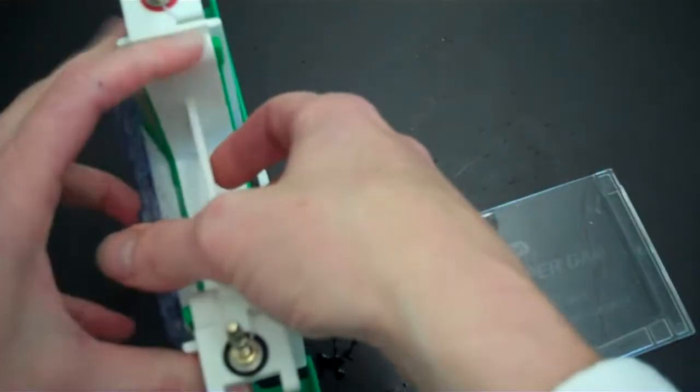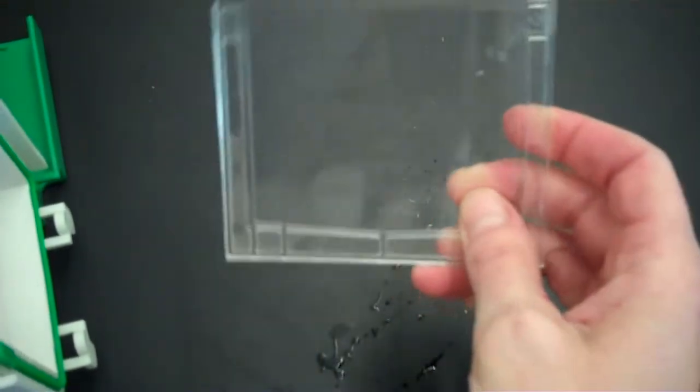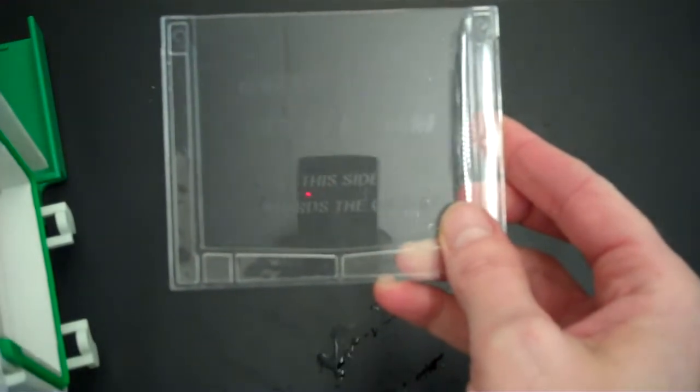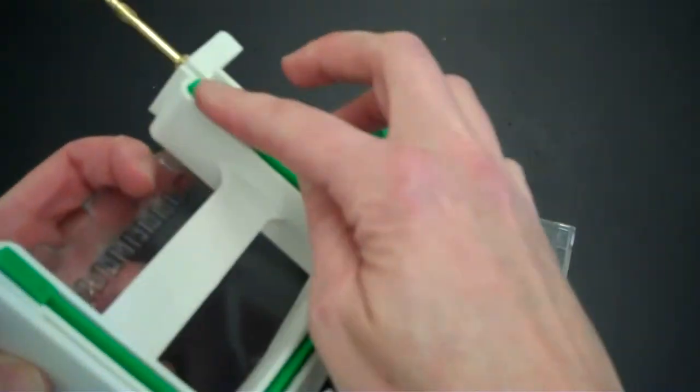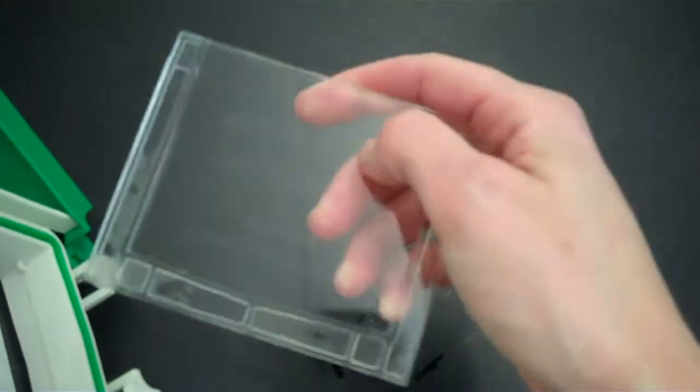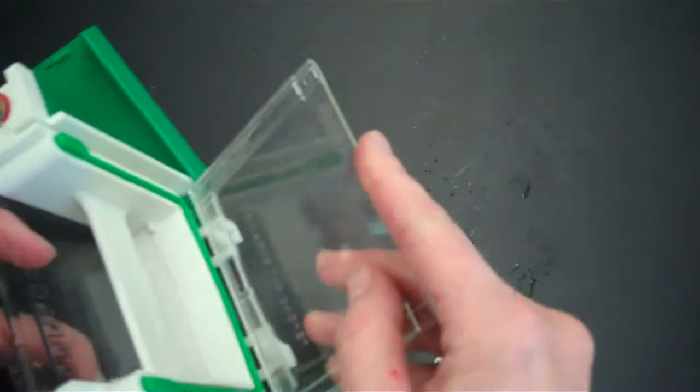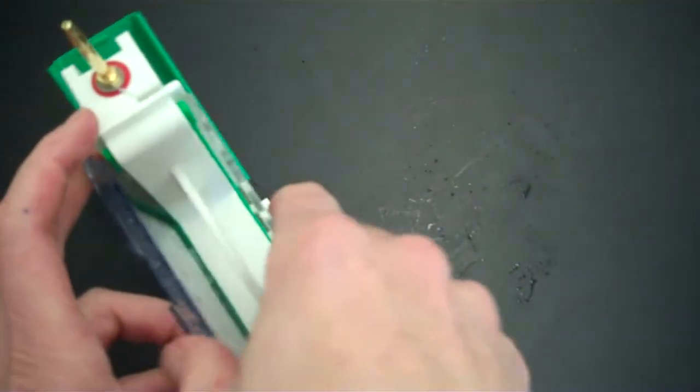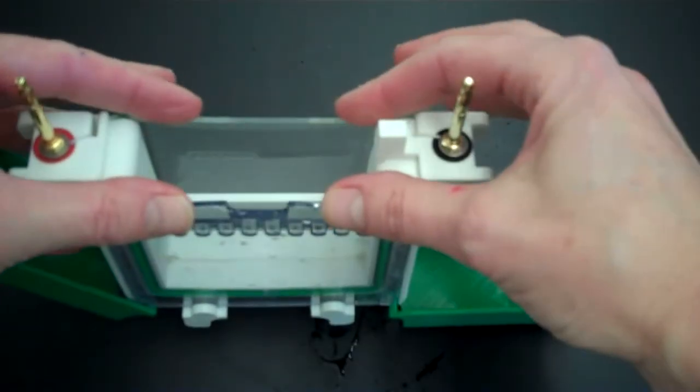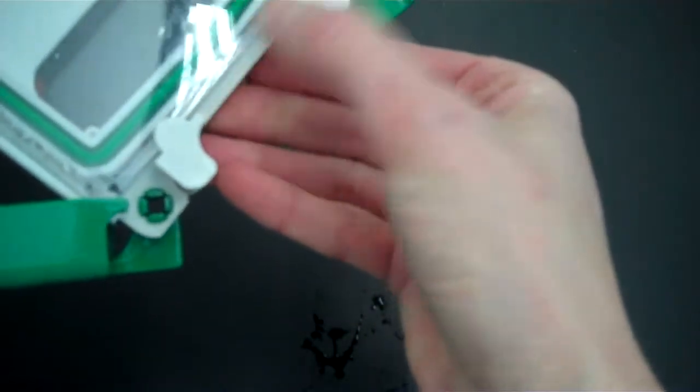Then the next thing that you're going to do is take your buffer dam. And if you read on here, it says buffer dam, this side toward the gasket. The gasket is this green rubber thing right here. So you're going to take that side that you can read and put it towards the gasket.